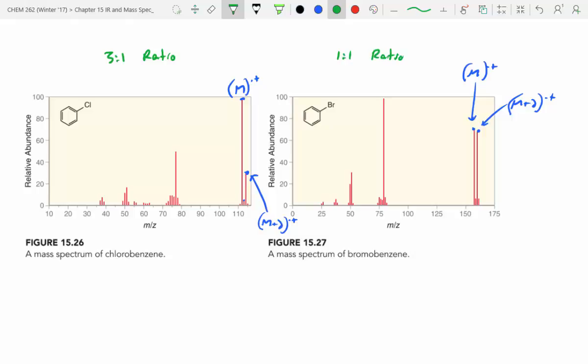If you don't see a mass plus 2 peak, that's a good indication that you don't have any bromines or chlorines too, so you can rule those out as well. So that's a really simple, easy tool you can look at. Does that make sense? If you go into weird inorganic compounds, you'll run into all sorts of odd isotopes, but as organic chemists, we're primarily concerned with that upper right-hand corner of the periodic table, and we're not even going to address those weird isotope patterns.